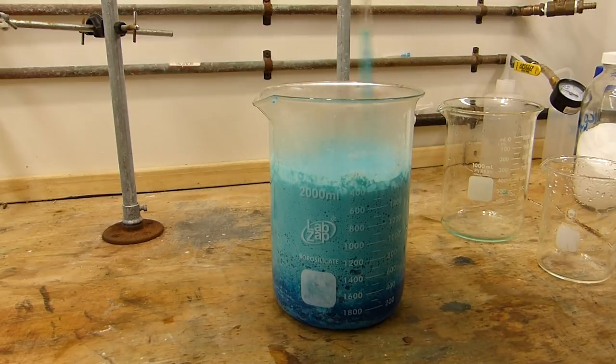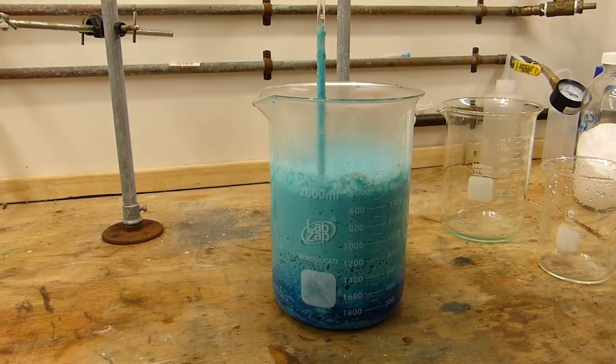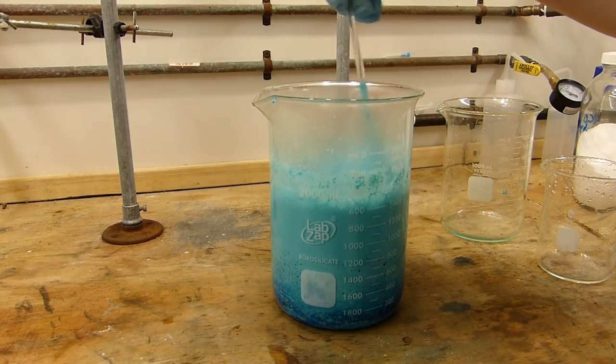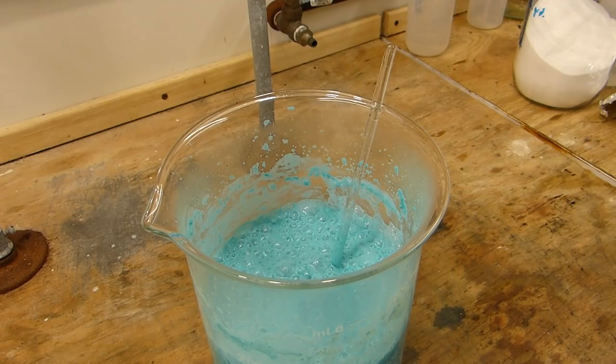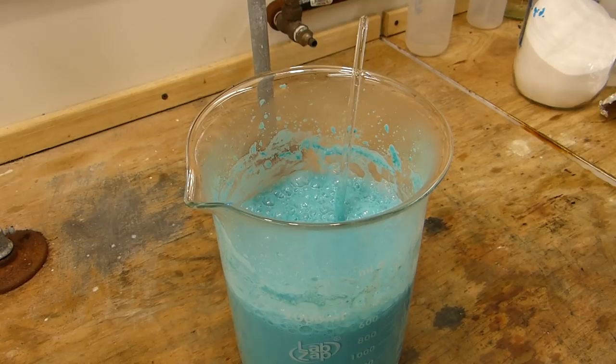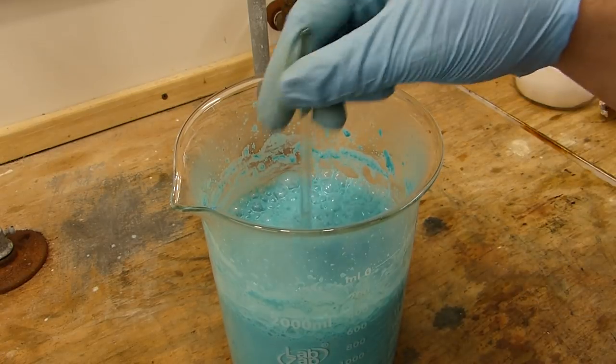This reaction will theoretically make 100 grams of basic copper two carbonate, which is this toothpaste sort of color that's forming here. And I'll just give this approximately 20 minutes to finish reacting while watching the foam. It'll slowly subside over time. And then we can go ahead and isolate the basic copper two carbonate.